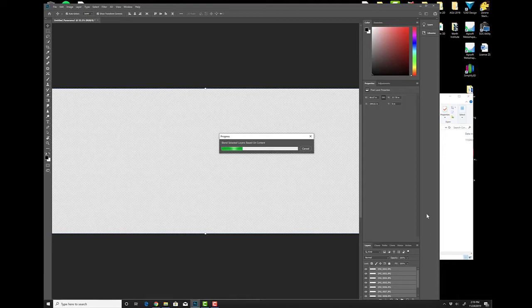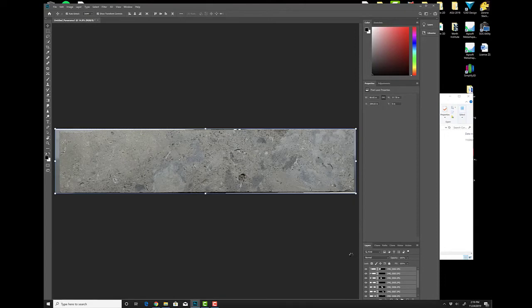The other thing that you can do in order to apply a very good scale bar is just take any type of measuring ruler, any geological ruler that you have that shows sediment or grain sizes and so on. And one of the things you can do is just place that on the edge of the drill core, just like so, and include it with your image. And that way you have a good sense of scale already in there. Well, we're just going to remove that for these demonstrations.